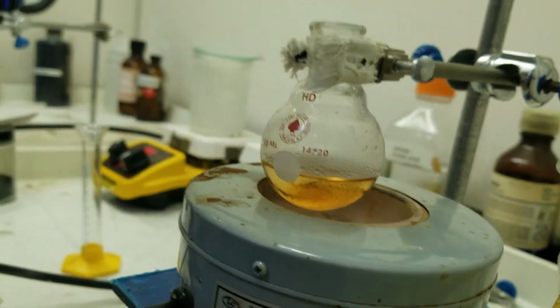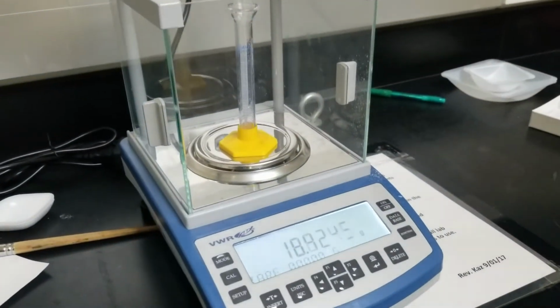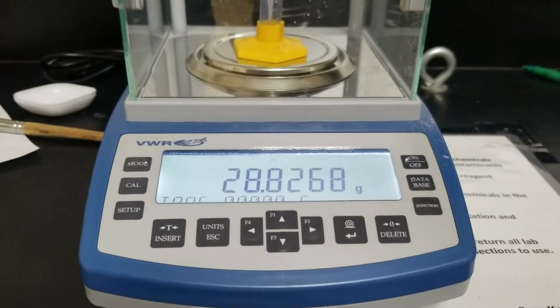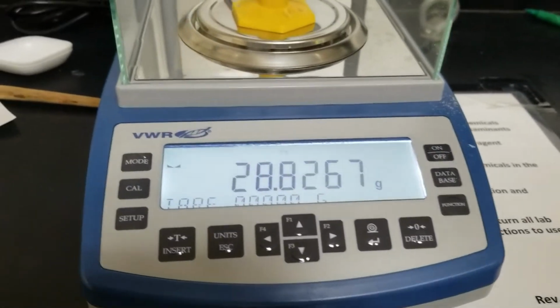Okay, let's now weigh how much aniline went in there. And this one could be our other limiting reagent. Remember, his ratio is 2 to 1. Should stop. Right there. There we go. Okay, record that. All right.